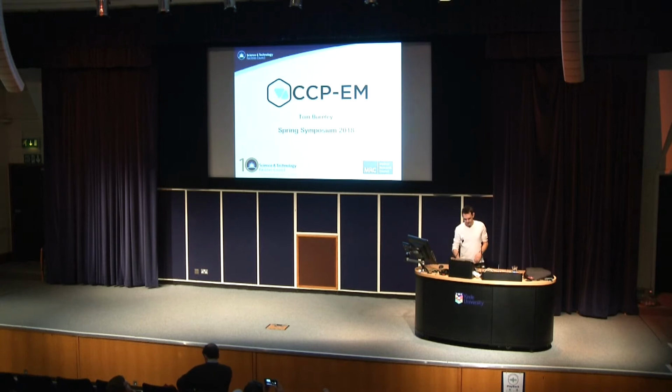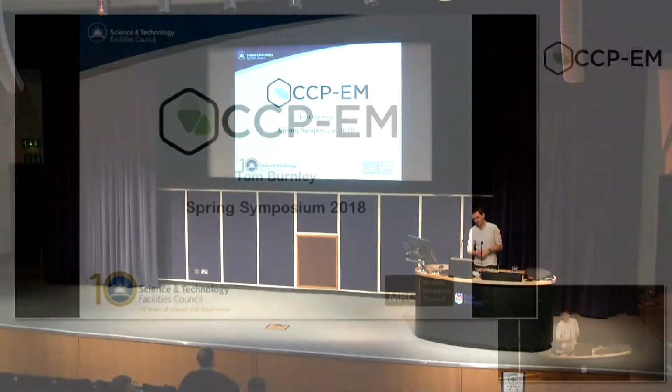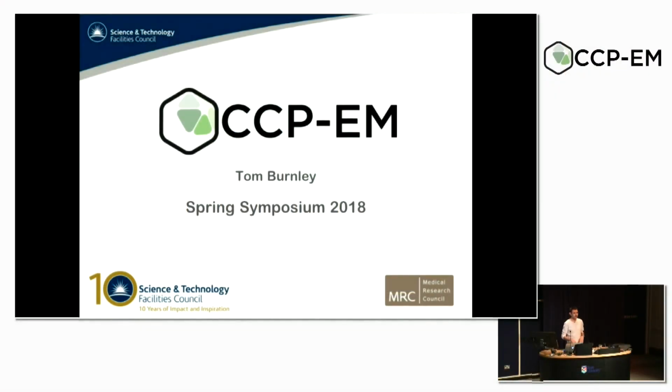Thanks, Colin. Morning, everyone. So as Colin said, my name's Tom Burnley. I'm one of the 3 CCP-EM developers now, alongside Colin and Agnel Joseph, who's also here. And I just want to spend 20 minutes giving a quick introduction to what we do as an organization, and then focusing on our software suite that we've just released.